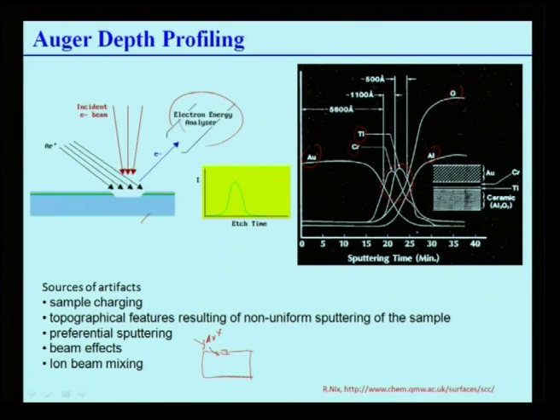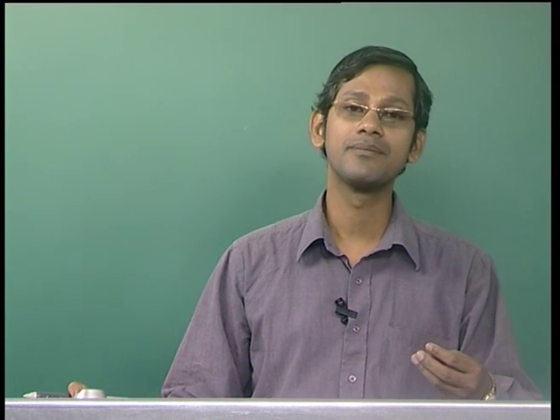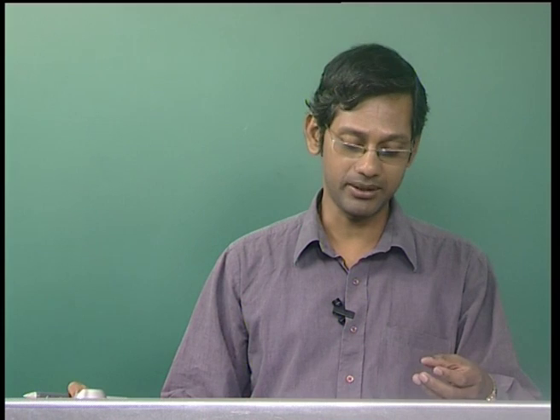So what does it mean? This is a very important aspect which you must know. This is actually required in material science. It means that although this is a very sensitive technique, it can be used to do such fine scale depth profiling by using argon ion sputtering.